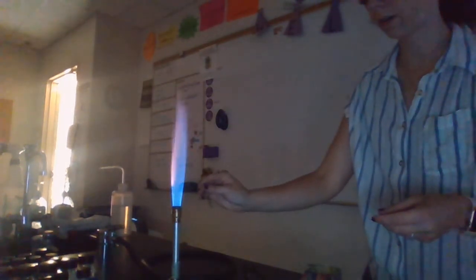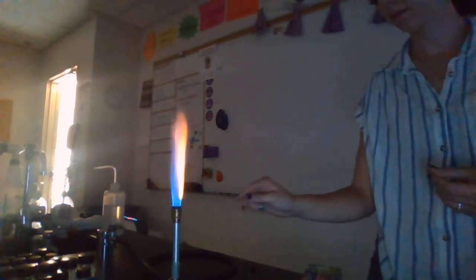Light purple color for the 4th one. And then we have number 5. All right, here's our 5th one. Ooh, bright orange for number 5. 5 is a bright orange flame.